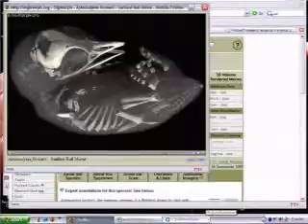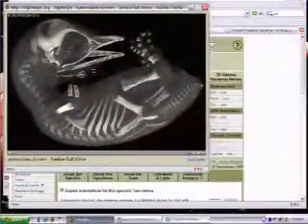So this is a 3D volume rendering, using proprietary visualization software, for which we have, over the course of probably 3 or 4 hours, shot a 90-frame animation and saved that out as a QuickTime movie. We actually only provide on the site these web-sized versions of these movies.